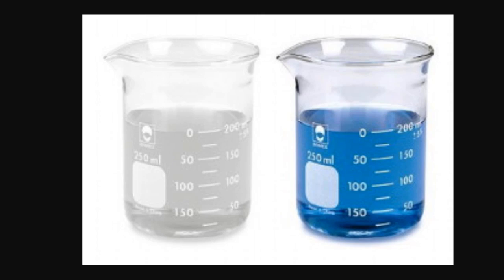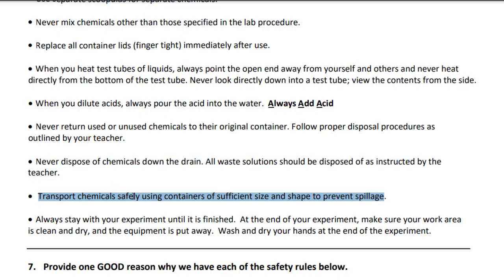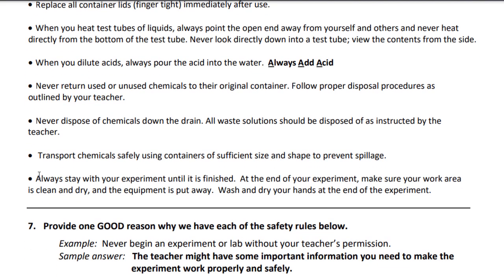Make sure that you can hold all the liquid or powder that you're supposed to be carrying. Okay, so hopefully that makes good sense. And then, of course, stick around until your experiment's done. Don't ditch your lab mates. Make sure that you're sticking around right to the end. And that includes making sure that at the end of your experiment, everything is clean and put away.